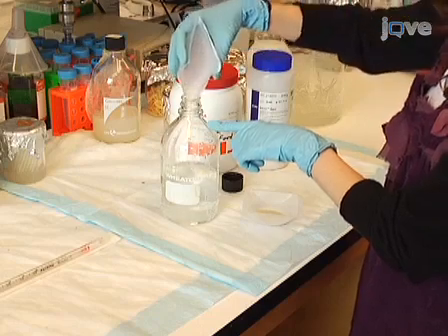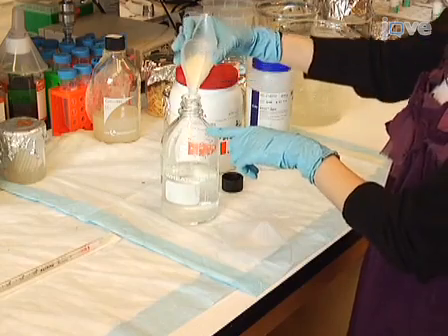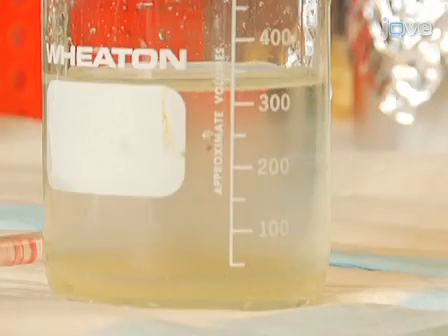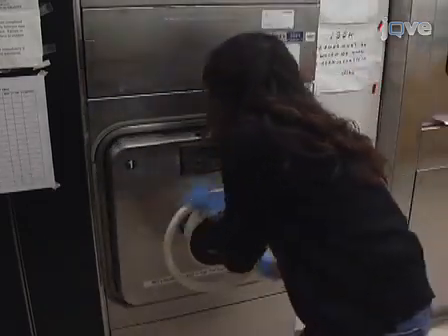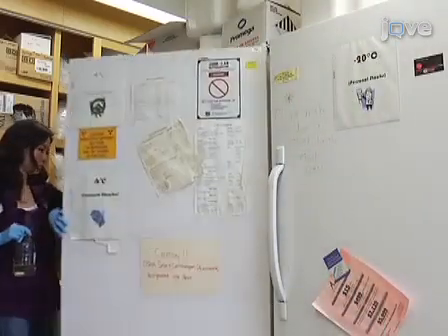To prepare food to load into the activity tubes, make a solution of 5% sucrose and 2% bacto-agar in distilled or tap water. Autoclave the solution. The autoclaved food can be used immediately or stored at 4 degrees Celsius for an extended period of time. Ideally, the food should be around 65 degrees Celsius for filling activity tubes.